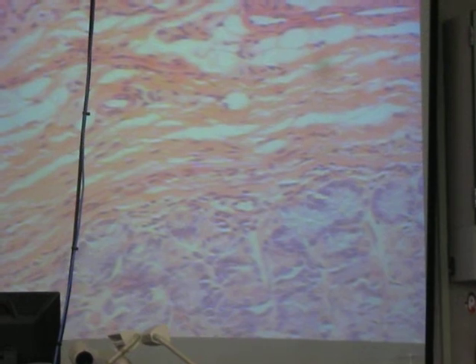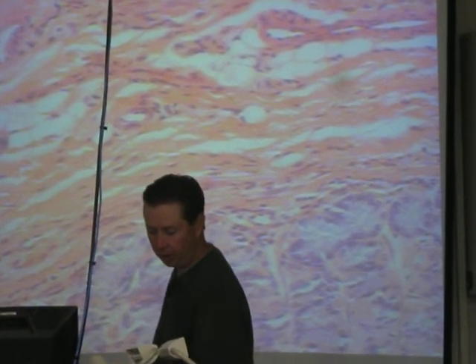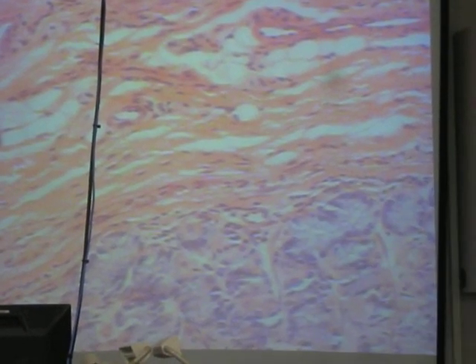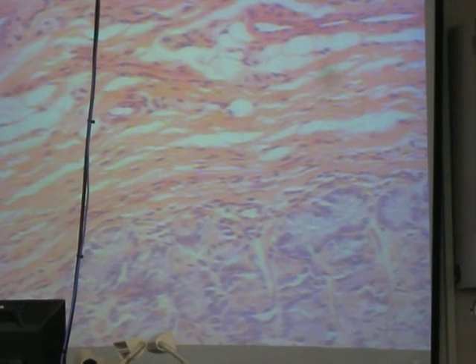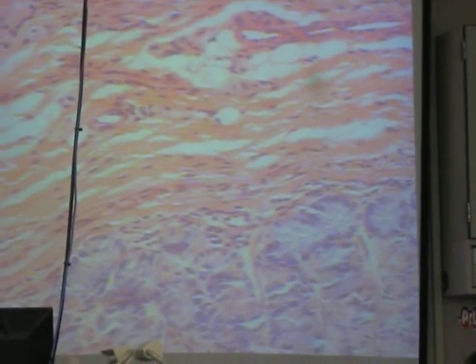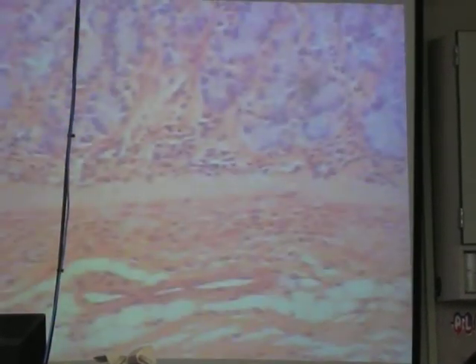That's another thing. If you look in the lab, it says muscularis externa, and you need to identify the 3 layers. I'm not going to ask you to do that on your slide. If you can identify it as muscularis externa, that's fine. You don't need to differentiate circular, longitudinal, and oblique on the slides. Okay, we had a couple of diagrams that you can identify those, but just the muscularis externa tissue is on here. Okay, so that's the stomach slide and what you're looking for on here.